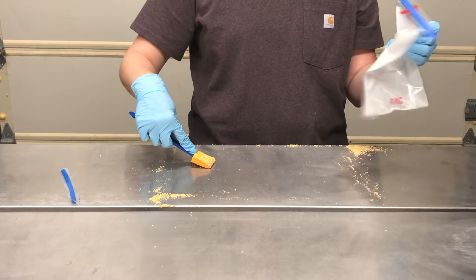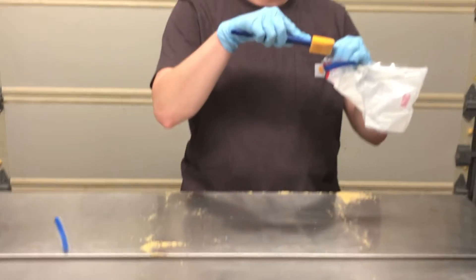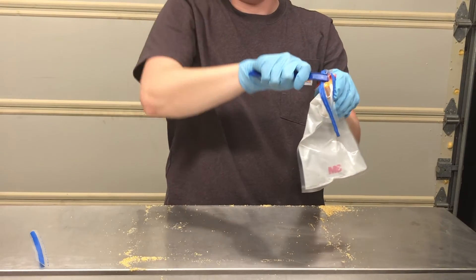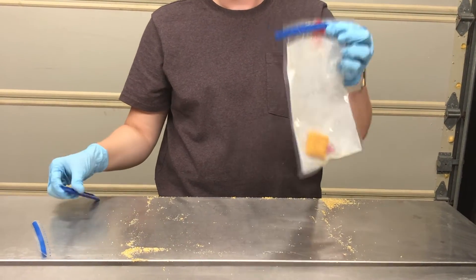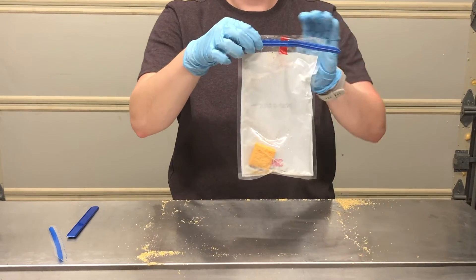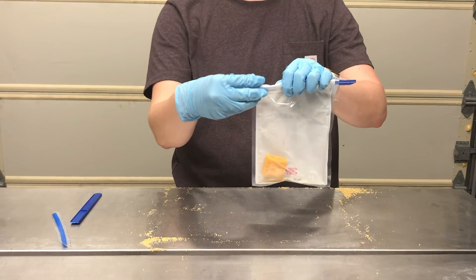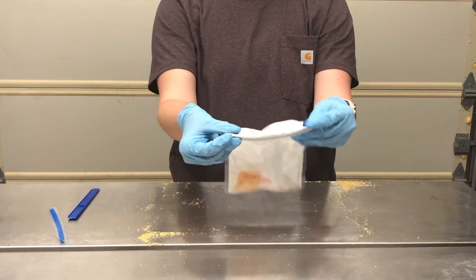After you have passed over the sampling area 10 times in both the horizontal and vertical direction, you will then place the sponge back in the bag and break off the blue plastic portion. Once the sponge is in the bag, fold over the top two to three times, then fold the metal tabs on the side over to secure the fold and ensure the sponge does not fall out of the bag.